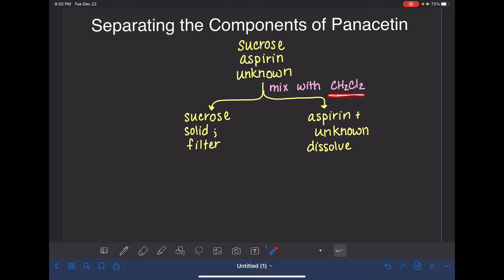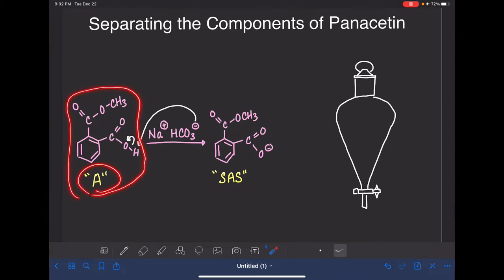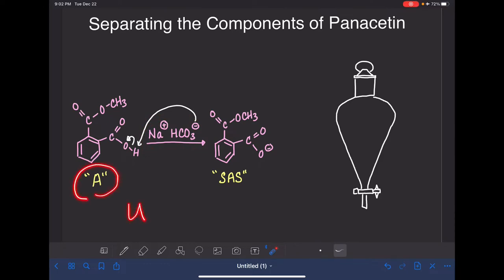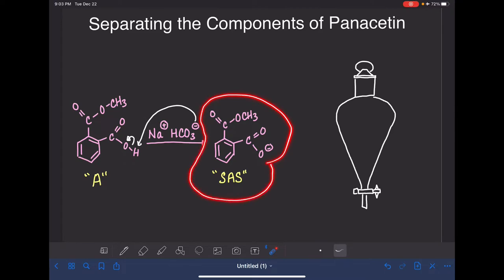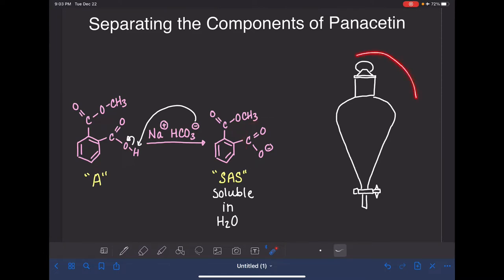Currently both the aspirin and the unknown are dissolved in the methylene dichloride solution — they have the same polarity. To separate them, we're going to use a technique called extraction. The aspirin molecule has a carboxylic acid functional group, which means it will react with a base such as sodium bicarbonate. The sodium bicarbonate will deprotonate the carboxylic acid and form an ionic compound called sodium acetylsalicylate. Because it's an ionic compound, it will be soluble in water — we're changing the polarity of the aspirin by changing its functional group. We'll do this in a piece of glassware called a separatory funnel.